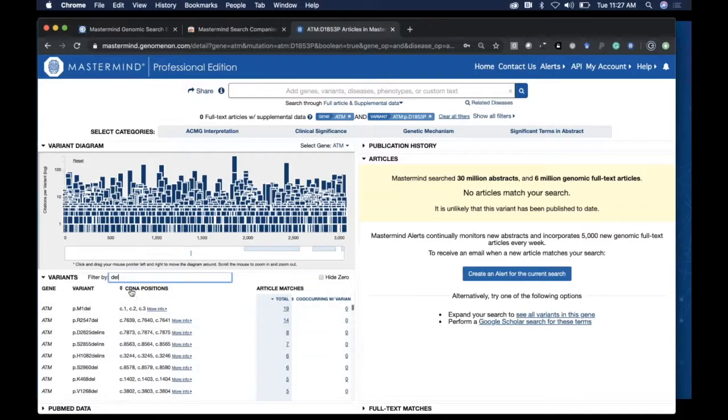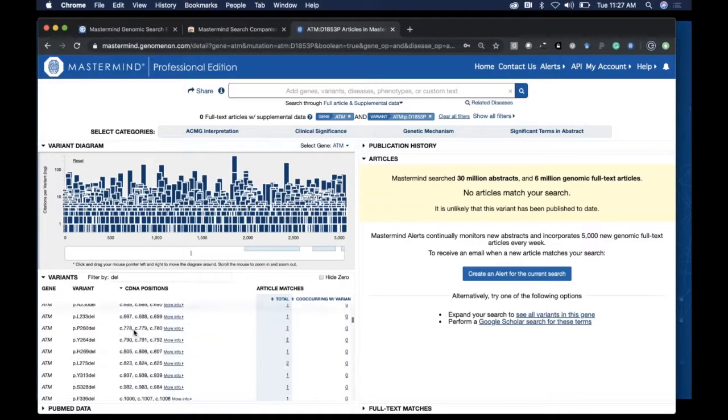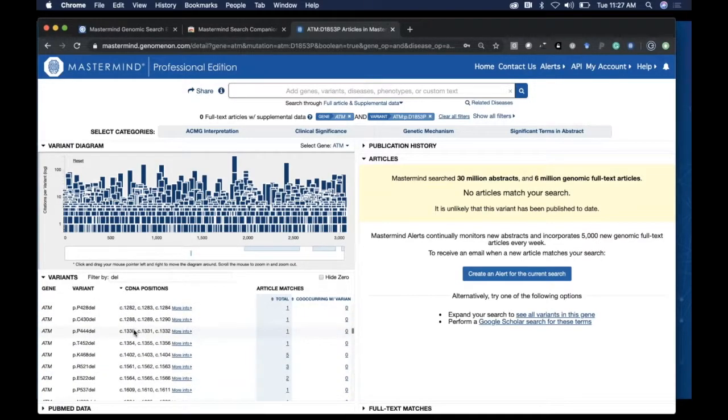One other capability that you have here when you've performed a search is sorting after filtering that list of variants by cDNA position, so that you can see, say, all of the variants that appear in the 5' region that's removed from your particular search, or otherwise variants in the neighboring vicinity of your particular variant that may not be right at that particular residue.